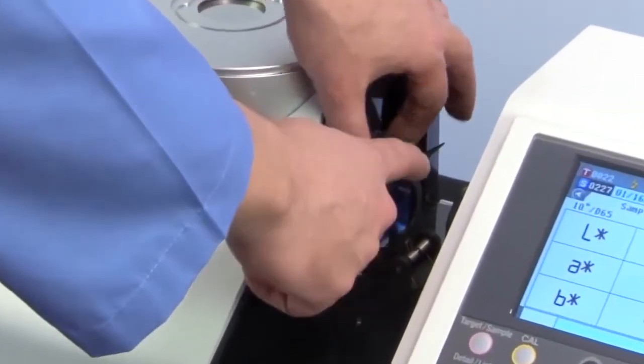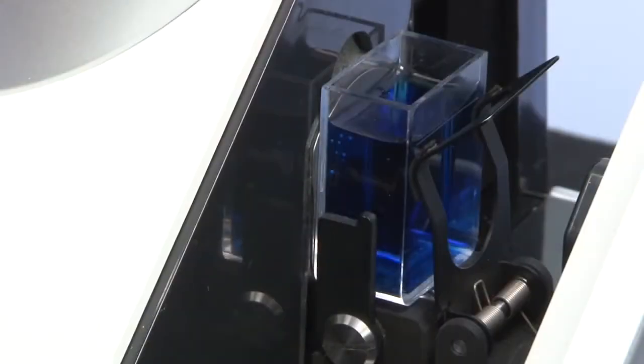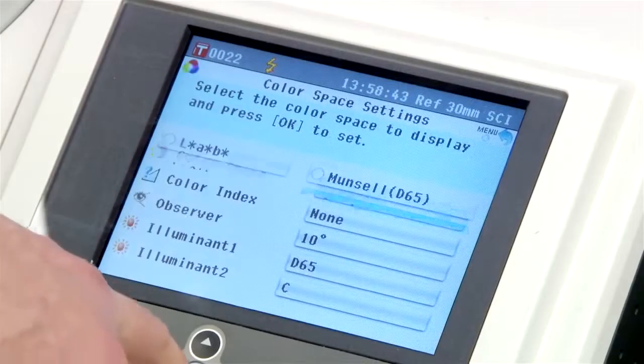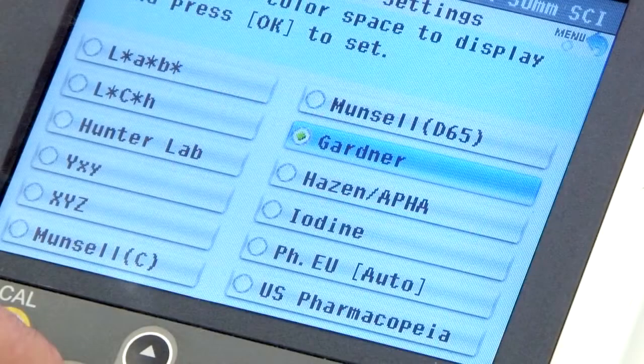In addition to classic colorimetric evaluation systems, the CM5 liquid measurements are evaluated in terms of industry specific indices.